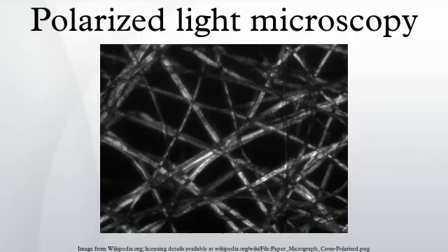These illumination techniques are most commonly used on birefringent samples where the polarized light interacts strongly with the sample and so generating contrast with the background. Polarized light microscopy is used extensively in optical mineralogy.